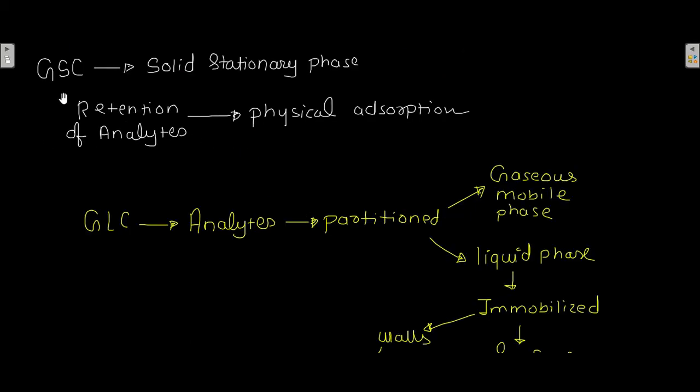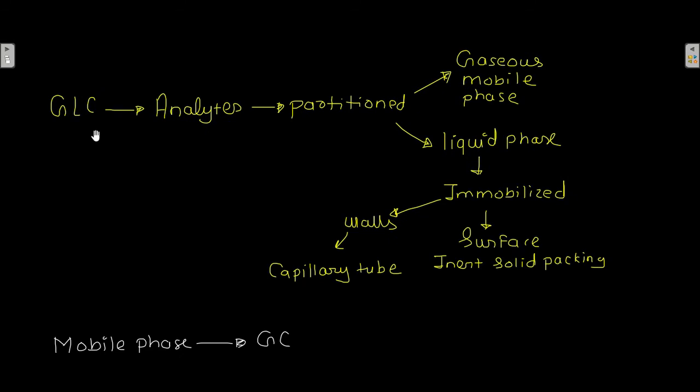Now, GSC, that is gas solid chromatography, is based on a solid stationary phase, and it involves the retention of analytes by physical adsorption. Now, there is GLC, which stands for gas liquid chromatography.